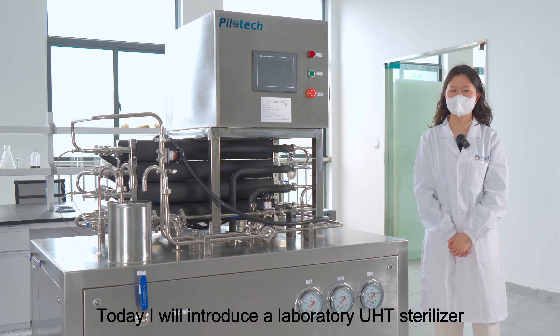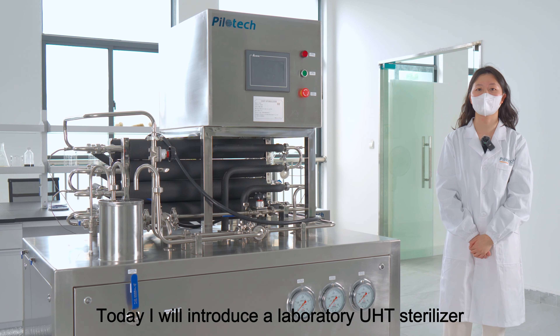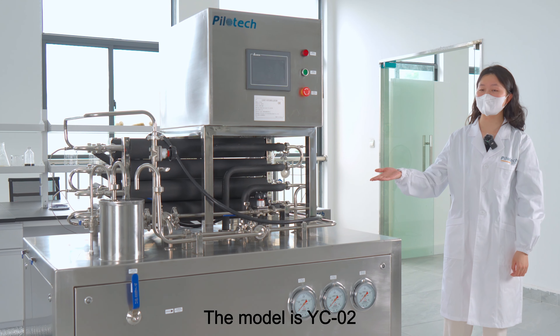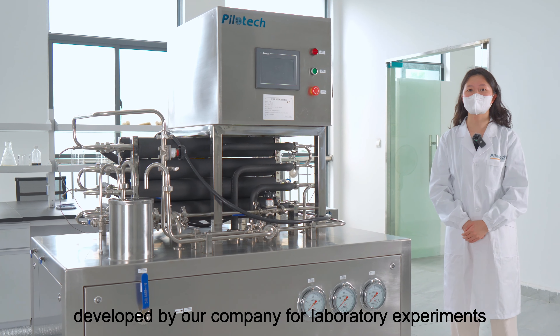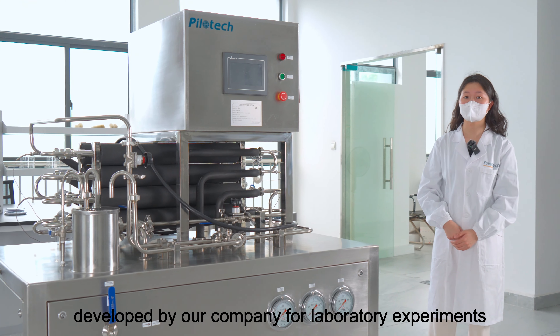Hey guys! Today I will introduce a laboratory UHT sterilizer. The model is YC02. This sterilizer is specially developed by our company for laboratory experiments.